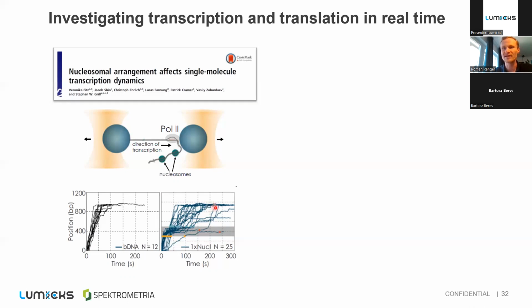And this is, of course, a really nice example of how you can use optical tweezers to really study transcription on the single molecule level, and also observe the impact of different proteins that are bound to the DNA on the polymerase activity and transcription.